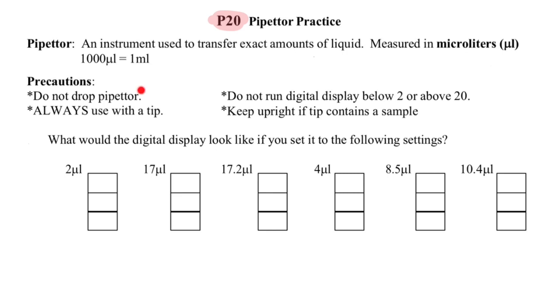The precautions would be: do not drop the pipetter, always use with a tip, do not run the digital display below 2 or above 20 because we are using P20. The range of volumes it can work with would be between 2 and 20 microliters. You also have to keep the tip upright when it contains a sample.